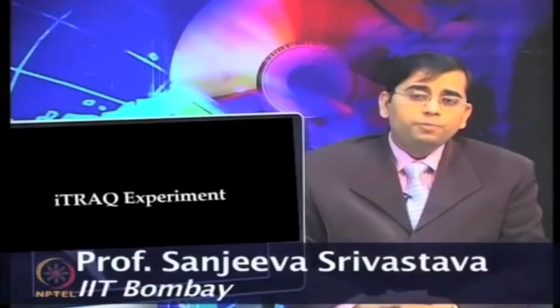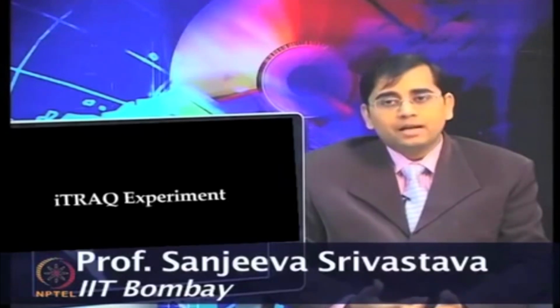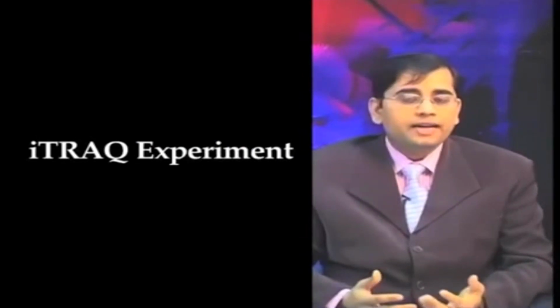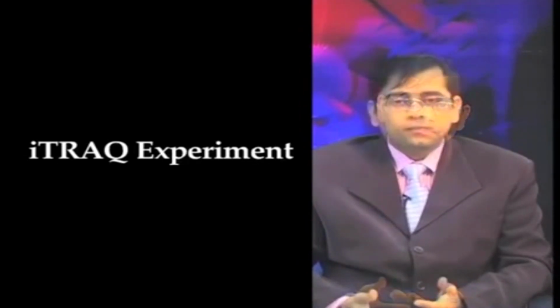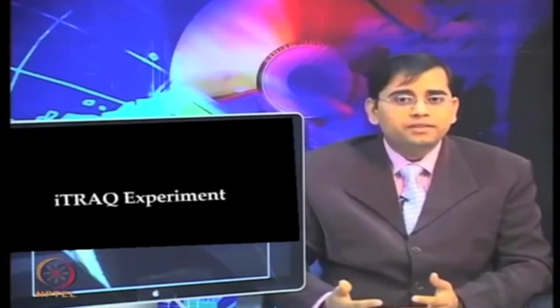We will now talk about how to perform an iTRAQ experiment. In an iTRAQ experiment, the control and treated protein samples are first reduced, alkylated and digested with trypsin. The digested samples are reacted with different iTRAQ reagents, 4-plex or 8-plex. The samples are then combined. In fact, it can be control and 3 treatments, or 4 different time course samples. So, 4 samples can be combined and analyzed by LC-MS-MS. As per the guidelines provided by Applied Biosystems, the protein samples can be prepared, and now we will discuss that step by step in the next few slides.